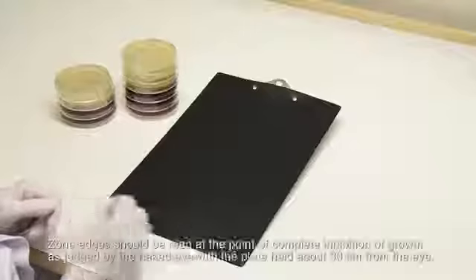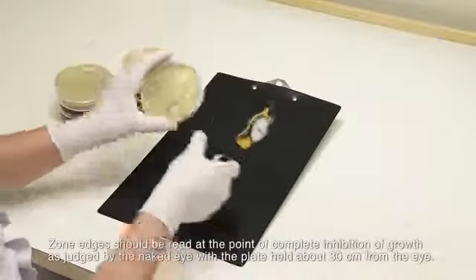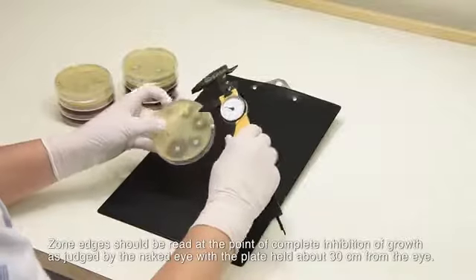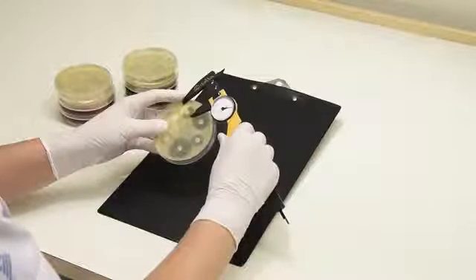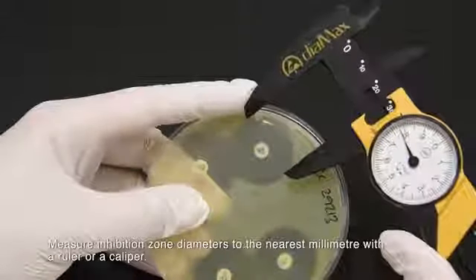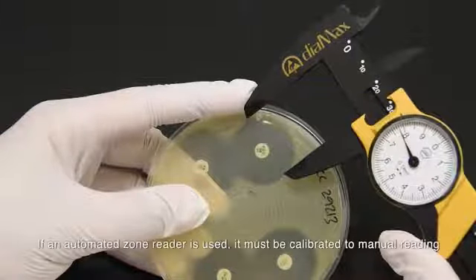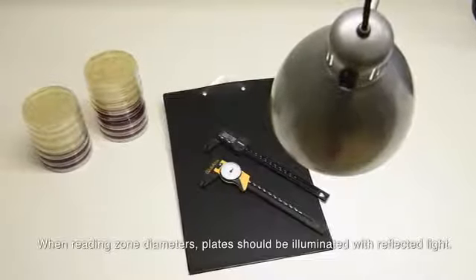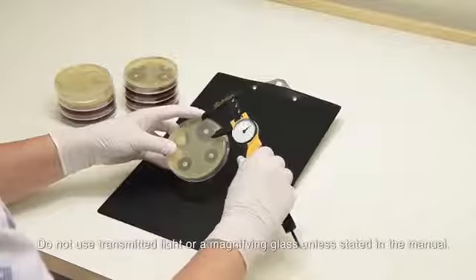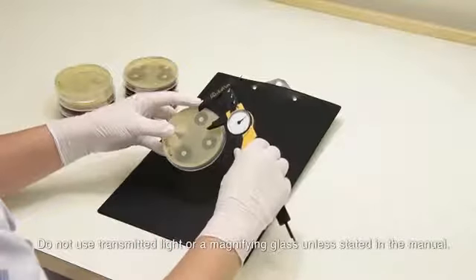repeated. Zone edges should be read at the point of complete inhibition of growth as judged by the naked eye, with the plate held about 30 centimeters from the eye. Measure inhibition zone diameters to the nearest millimeter with a ruler or a caliper. If an automated zone reader is used, it must be calibrated to manual reading. When reading zone diameters, plates should be illuminated with reflected light. Do not use transmitted light or a magnifying glass unless so stated in the manual.